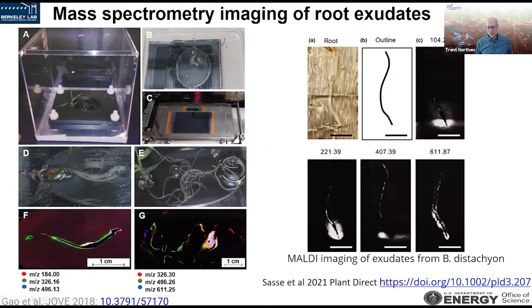And we've repeated this study more recently using MALDI imaging, where we took a stainless steel target, coated it with a thin layer of agarose gel, and grew the plant on top of it. Again, we can see various ions that correspond to metabolites. It's very difficult to identify what they are, but none of these masses correspond to the phenolic acids that we're interested in.